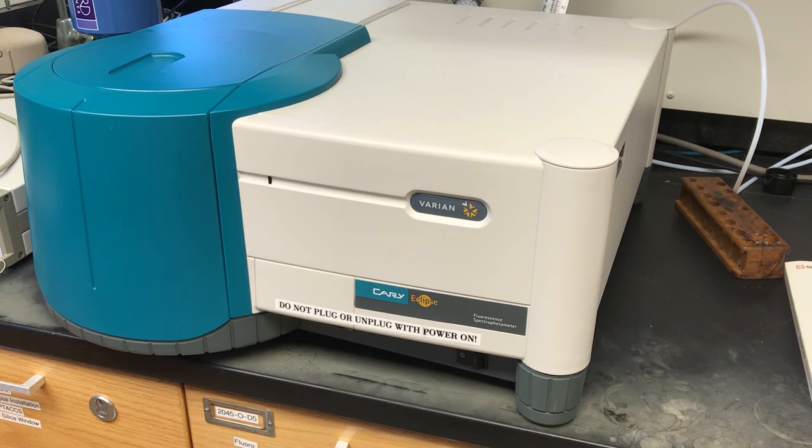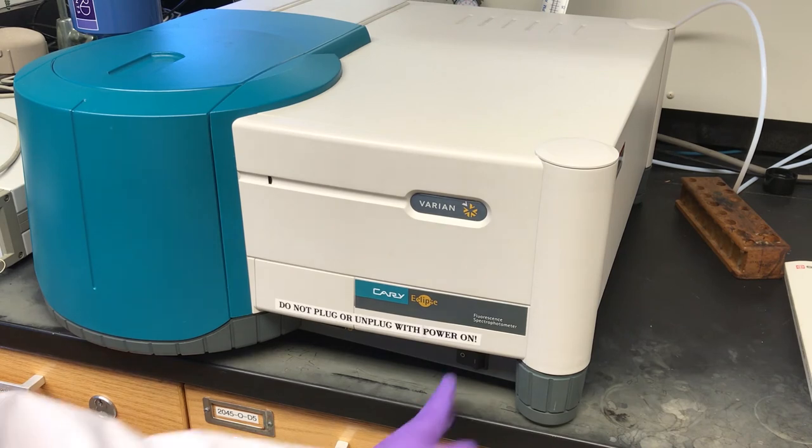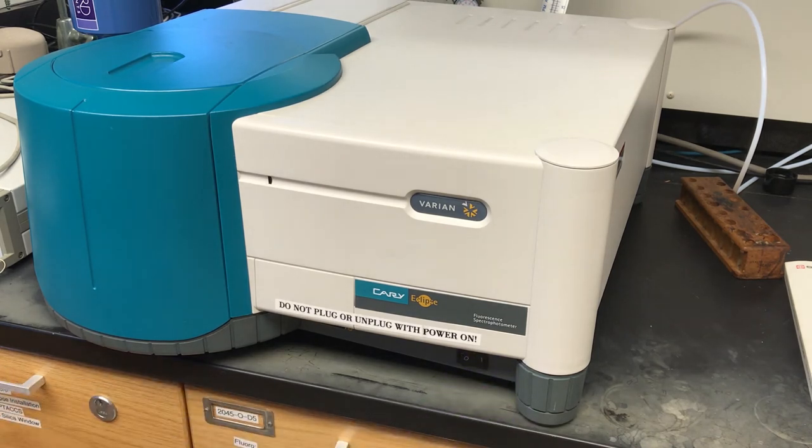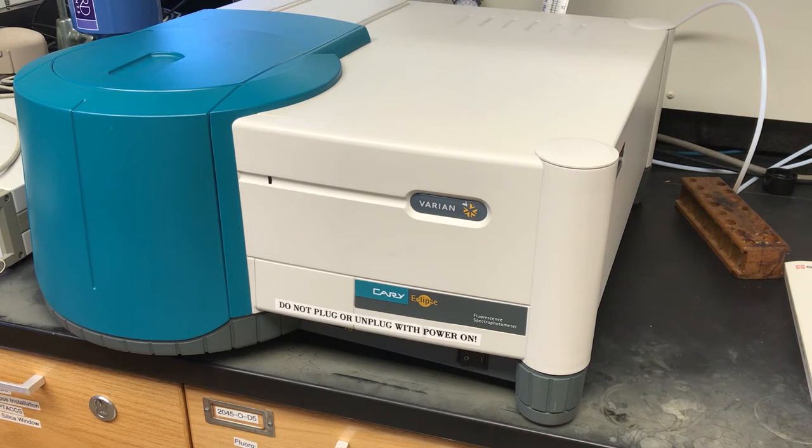To turn on the fluorescent spectrometer, you simply flip the switch on the front of the instrument. Once that's on, you can start the software.